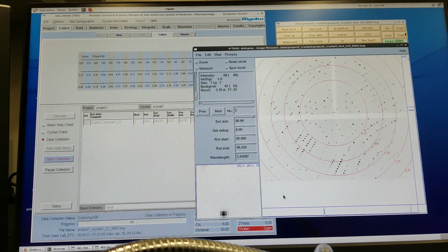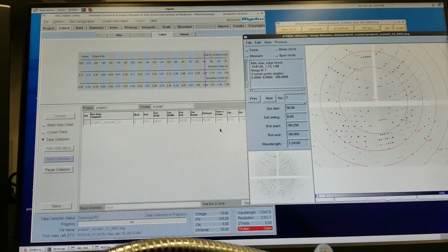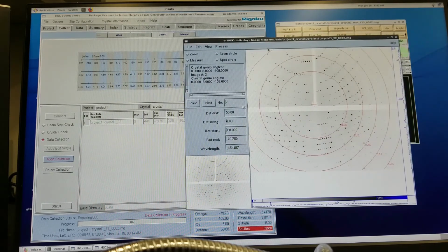Okay, so the collection started, so every 10 seconds it's going to refresh and show a new image of that crystal. So this will go and collect 441 frames, 10 seconds each, and I'm going to tell you the time it's going to end here. And that'll be a complete data set. And then in the next lecture, we'll take this complete data set and go ahead and solve the structure.